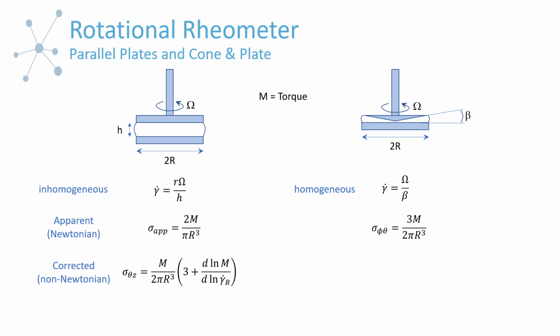I point this out because, as I stated before, there seem to be some misconceptions when you compare different instrumentation with each other. And this is where all instruments are doing the calculation. No one directly controls shear rate. Shear rate, for example, is always calculated.